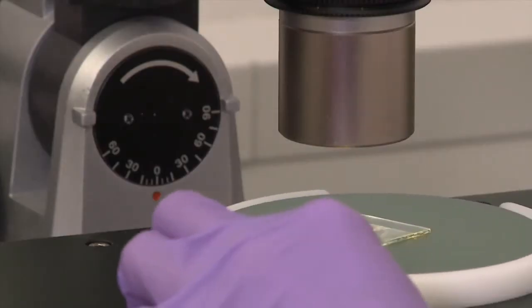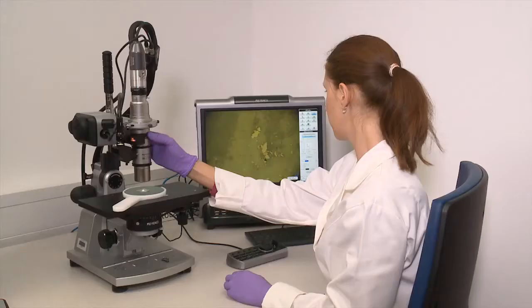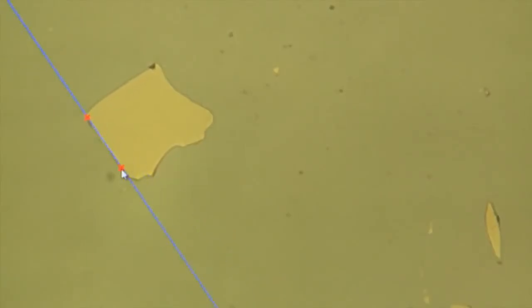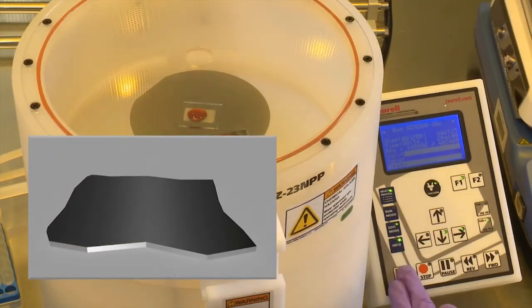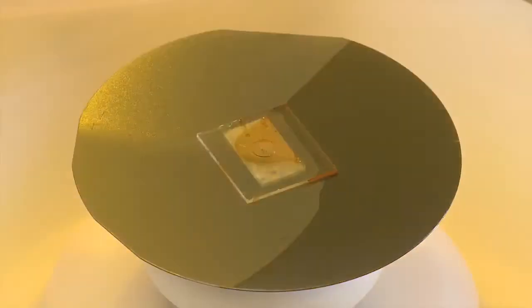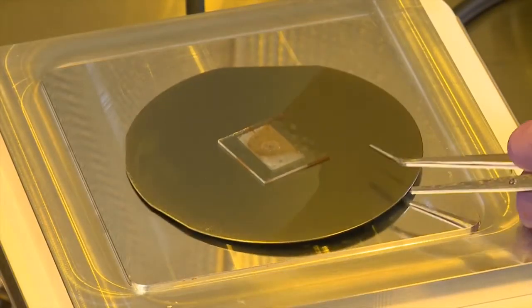The result of the deposition is checked under a microscope. The surface of the substrate is inspected for appropriate candidates to pattern the electrodes on them. For this purpose, a photoresist is spin-coated on the crystal. By spin coating, thin film of the selected thickness is obtained, which is eventually fixed and dried by baking it briefly.